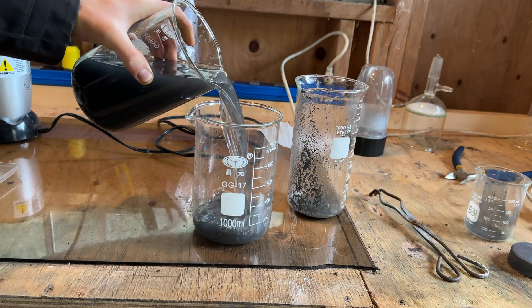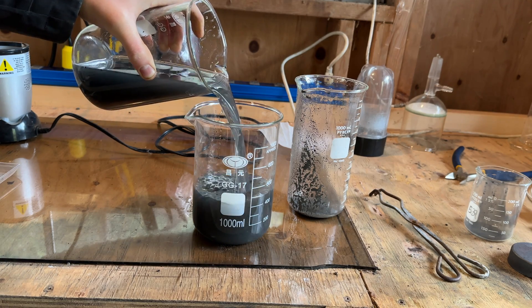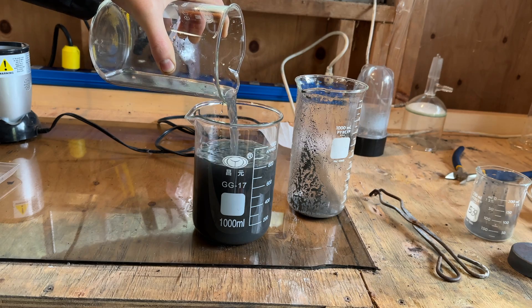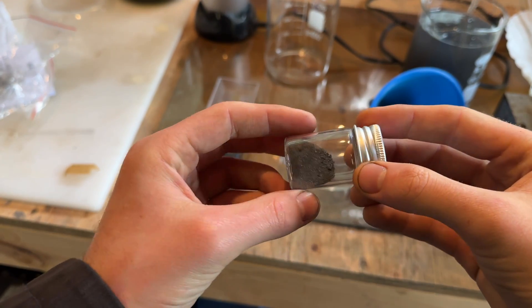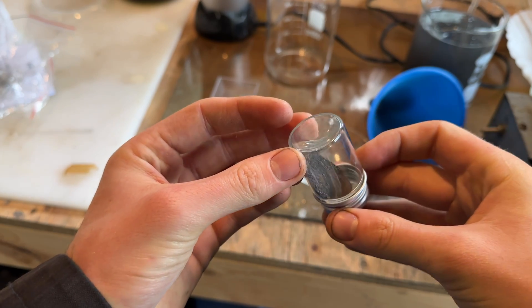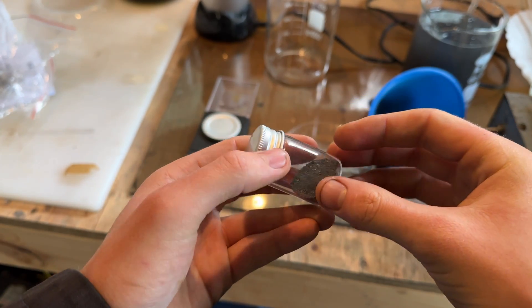If desired, hydrochloric acid could be added to the charcoal dust to dissolve the remaining tin and it could be electroplated out of solution, but that could be saved for another project. This tin will be used specifically to make some tin-4 chloride, which is a very cool, highly reactive fuming liquid. I hope you guys enjoyed, and I'll see you in a future project.